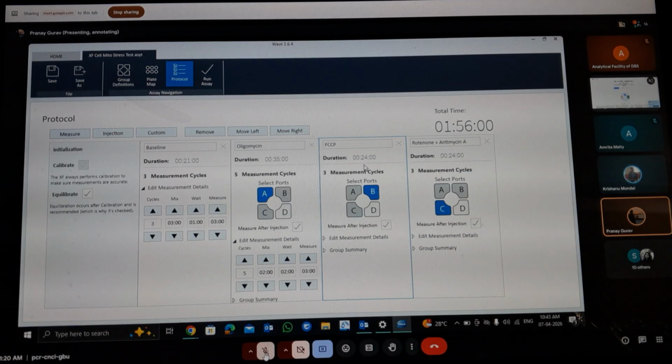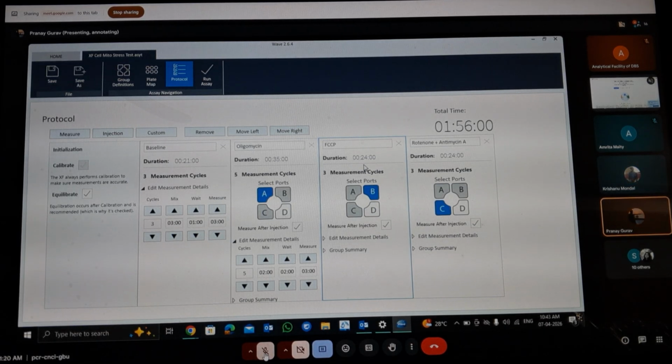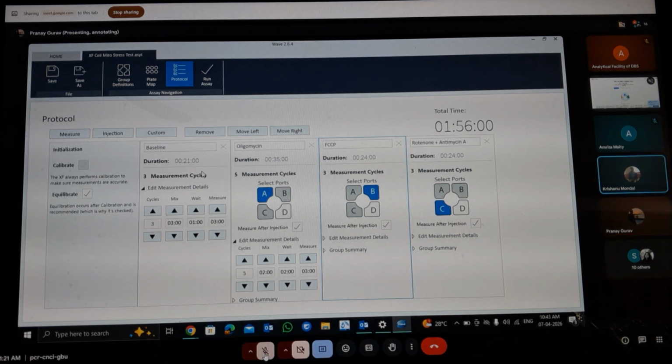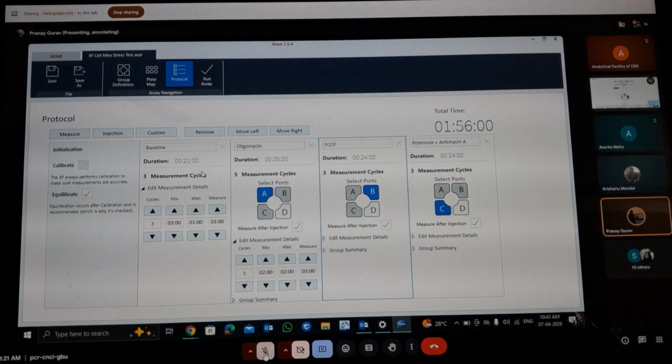And it will plot an average of that on the screen. Once I share, we will even look at one data. So the measurement in one single cycle will go on for 3 minutes, and an average will be plotted along with the error bars. So an average over 3 minutes of data. Yeah. So one cycle, 3 minutes of continuous measurements. Okay. Fine.